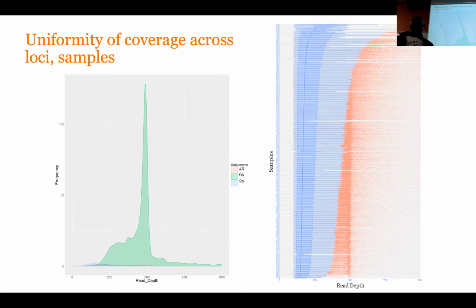Well, you don't know. You're just looking at the distribution of your read depth. You're hoping that if you're sequencing everything at about the same rate, if you get 20x coverage, everything should cluster together at 20x, right? But you're going to have variation in terms of coverage.